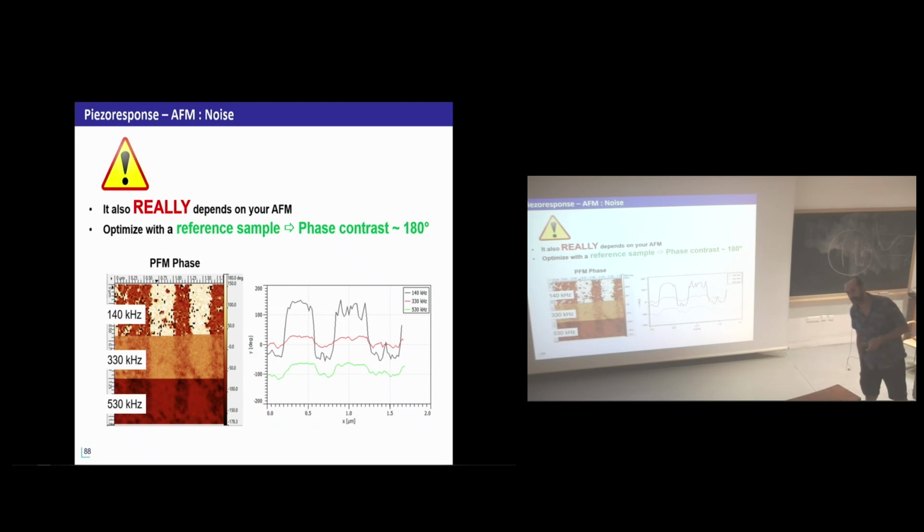Yeah. When you choose the frequency, you have to choose where you have amplitude. If you are too far, there is no amplitude. So you are kind of forced to be on the edge of the resonant curve. No, I don't like resonance stuff. You don't control anything with that. But you're talking about the resonance of the contact, yes, not of the cantilever itself. But for other people, it's important to make the difference. The problem is when you are using the resonance or close to the resonance, there is an additional effect you do not control that increases your amplitude. Okay?